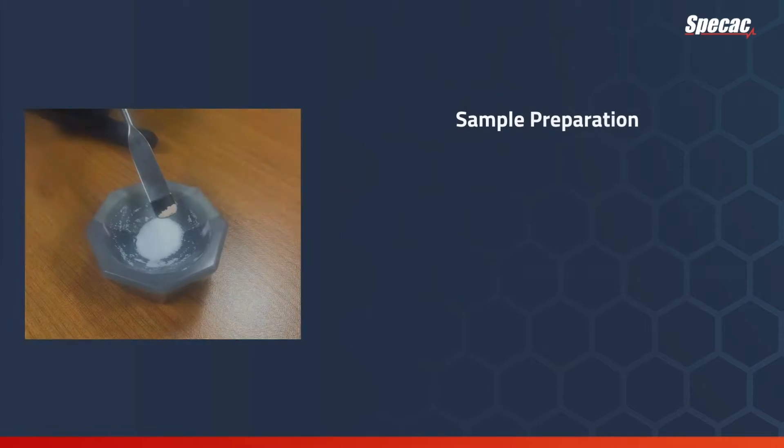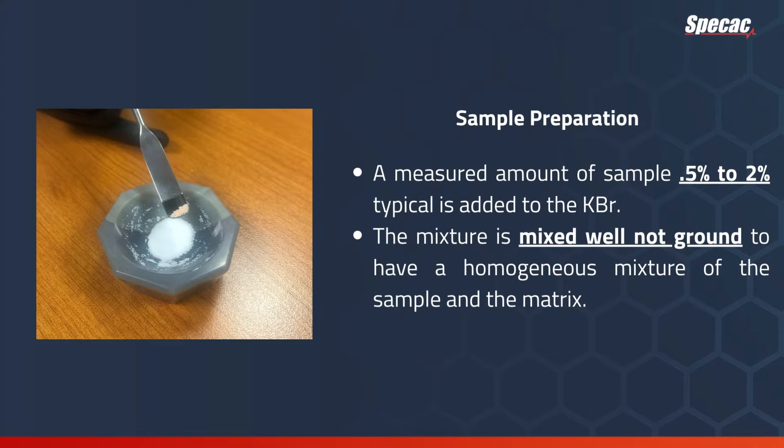To prepare the sample, a measured amount of sample — half a percent to two percent is typical — is added to the KBR. The mixture is mixed well, not ground, to achieve a homogeneous mixture of the sample and the matrix.